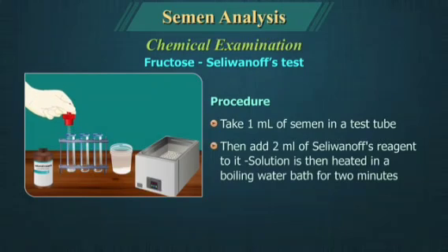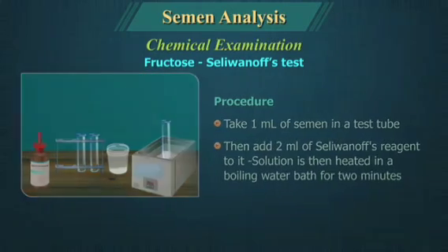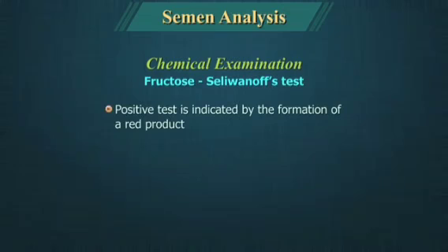Add 2 ml of Seliwanoff's reagent to it. The solution is then heated in a boiling water bath for 2 minutes. A positive test is indicated by formation of a red product.